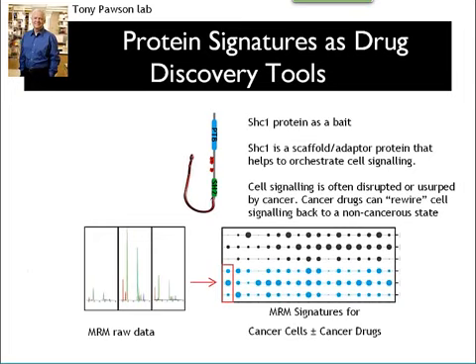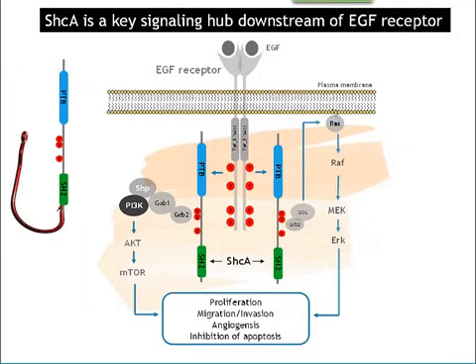And then because we're measuring so many signals, not just a single drug, but many, many peptides of many, many proteins, we've tried very carefully to figure out what is the best way to represent these data so that it makes sense to people who don't want to get into the incredible amount of information that such an assay actually gives you. So a little bit more about SHIC.